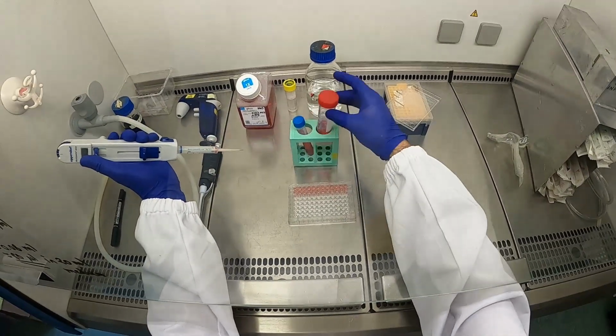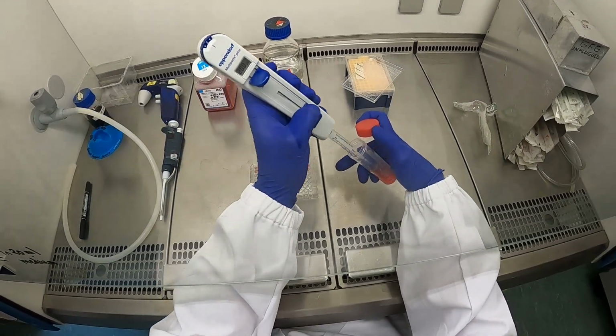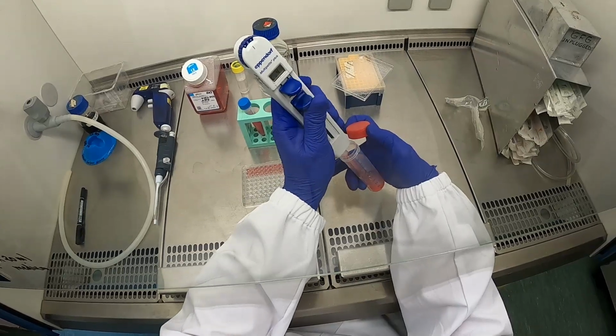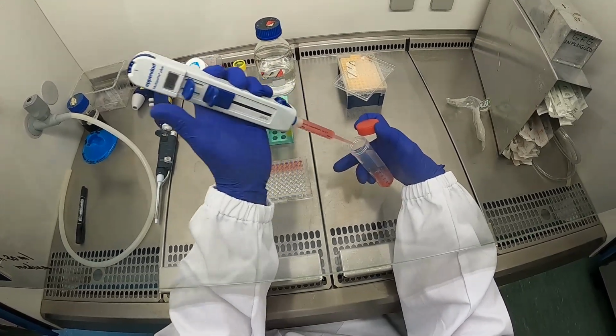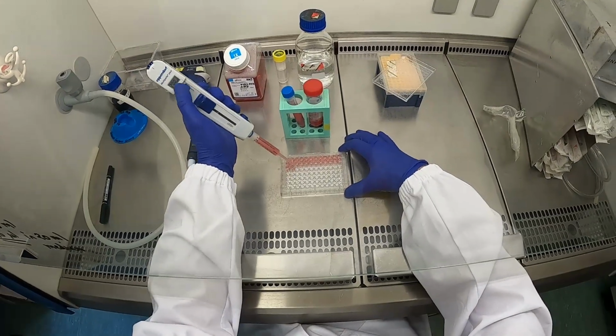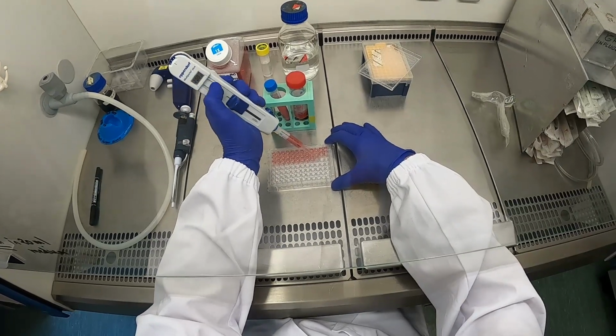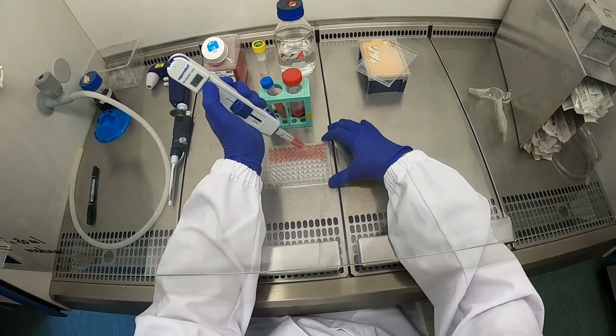But when you get to the end, be careful, because the last one might not be the full 200 microliters. Empty it, fill it by pulling up the plunger, reset it so the volume is accurately set, and there you go, dispensing 200 microliters each time in each well.